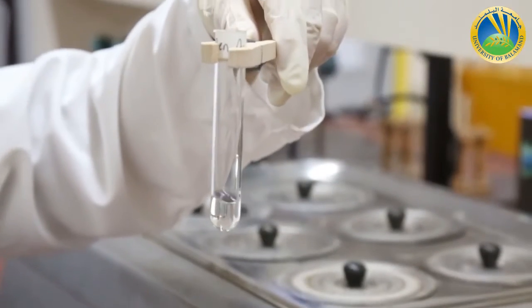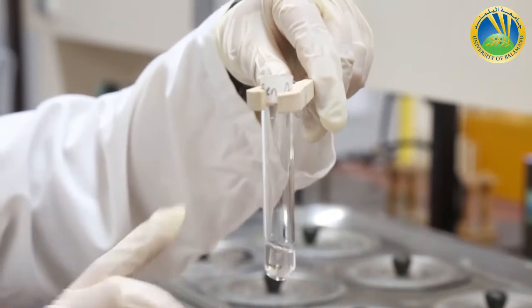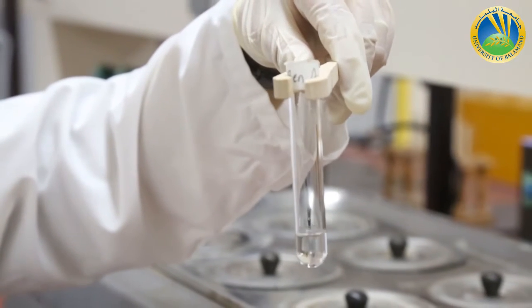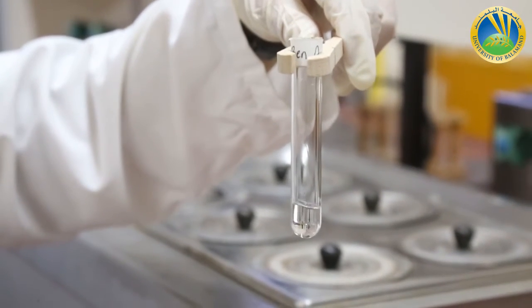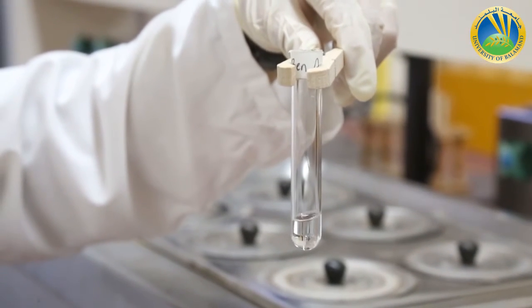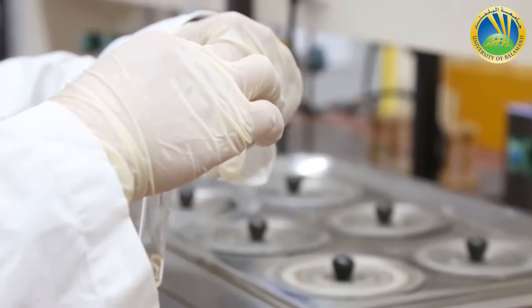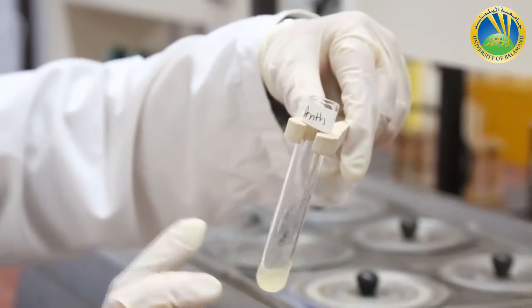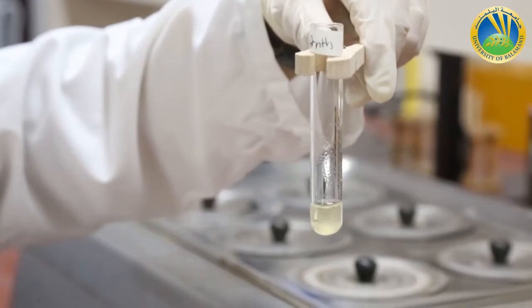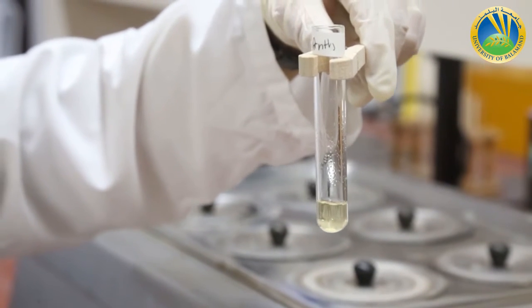This is benzoic acid inside acetone at cold. I see no more granules inside the tube, so I can say that benzoic acid is totally soluble inside acetone at cold. Now anthracene. If I shake well, I see no more anthracene inside acetone at cold.